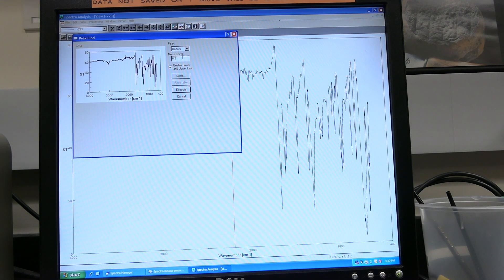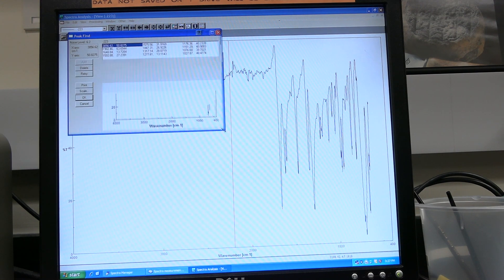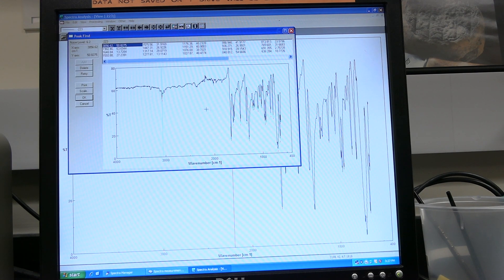For peak, set from where to detect peaks. Set the desired noise level. Click on execute. Expand the window if needed. A list of peaks will be available on the top of the window.